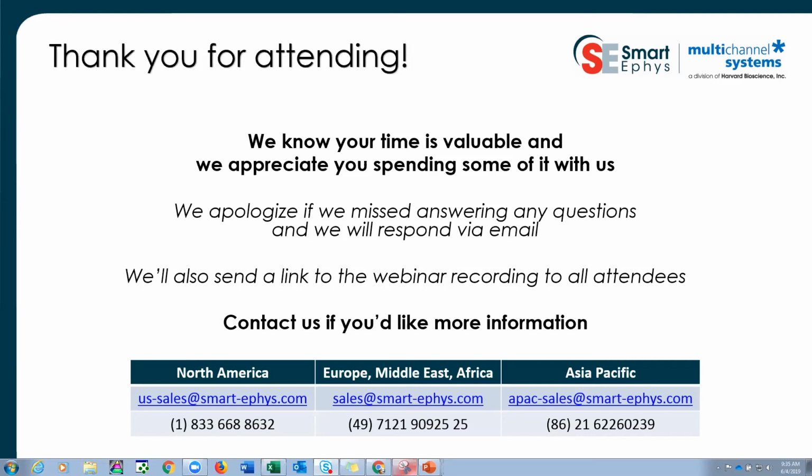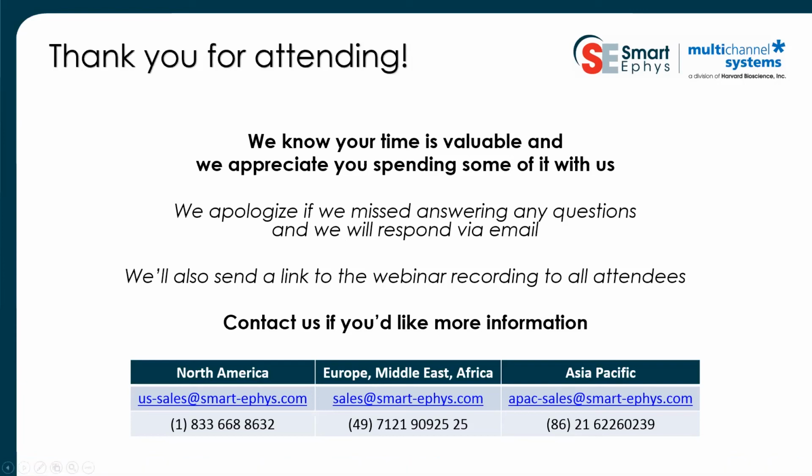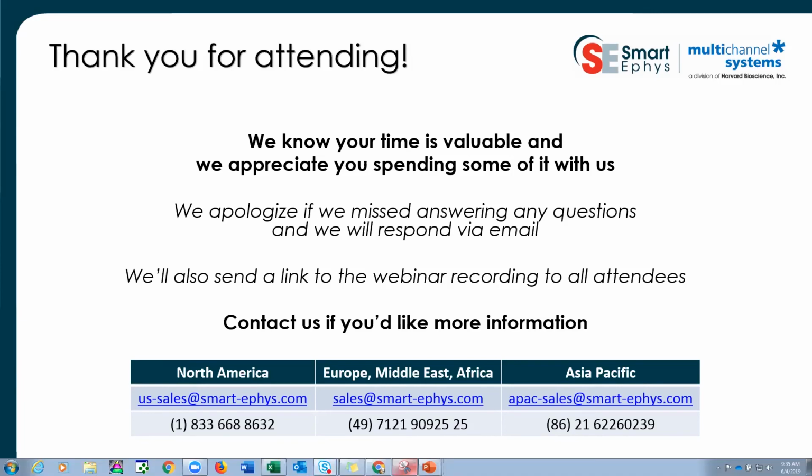There's a group in France, in Bordeaux, and they also published alpha cell activity on MEAs. But if I remember correctly, they dispersed the cells. So they no longer had intact islets, but cell clusters, and probably a cluster with many alpha cells on top of the electrode. So in theory, it's possible, but I never recorded alpha cell activity myself.